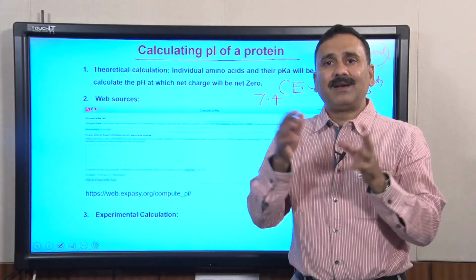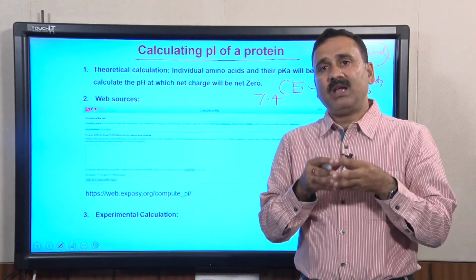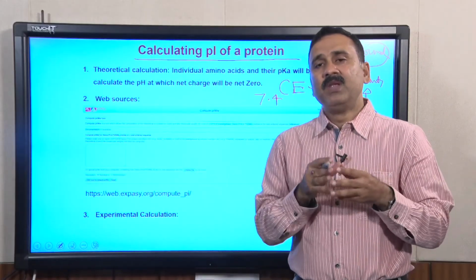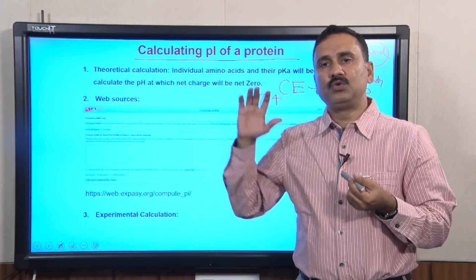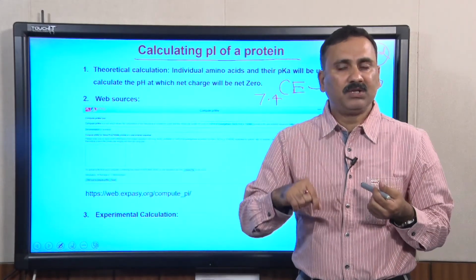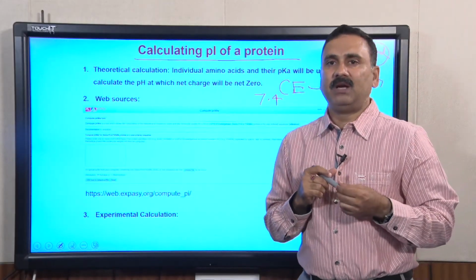But this kind of trial and error method was used when people did not have any information about the pI values, the amino acid sequences, or the genomic sequences. But nowadays you have different types of approaches, so you should not go by trial and error. You can very precisely use cation exchange chromatography or anion exchange chromatography by simply calculating the pI values, and there are three approaches by which you can calculate the pI values.